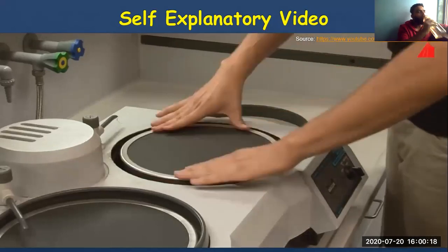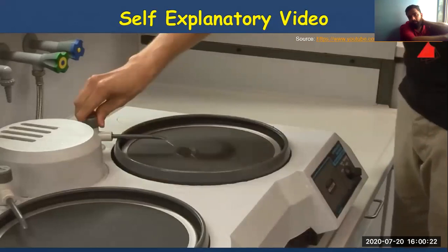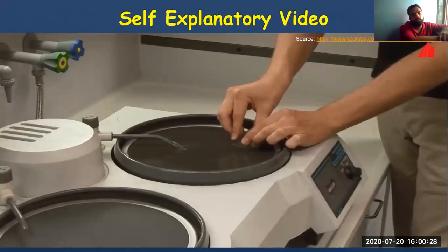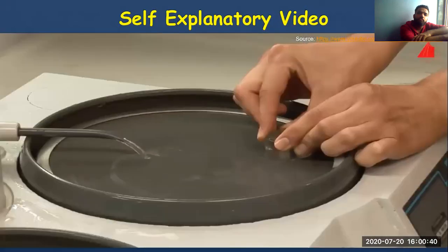Rotating the specimen by 90 degrees leads to new grinding grooves perpendicular to the old ones. In this way, the material tester can easily check whether the old grinding grooves have been removed completely. It is important to use sufficient water flushing during grinding. This keeps the sample cool and prevents the abrasive paper from being loaded with material particles.